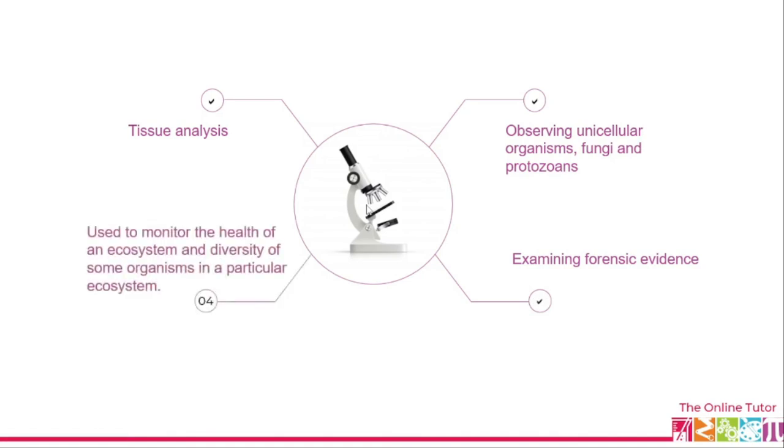And then we also use the microscope to monitor the health of an ecosystem and the diversity of some organisms in a particular ecosystem. So if you want to observe the diversity of organisms in a particular environment over a long period of time, sometimes you need to take samples and visualize them under the microscope to be able to make meaningful deductions about the health of the ecosystem over a long period of time.